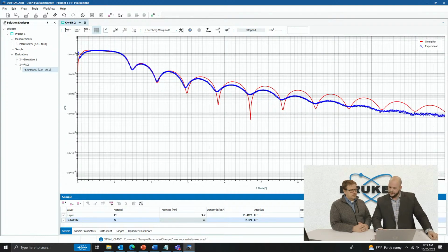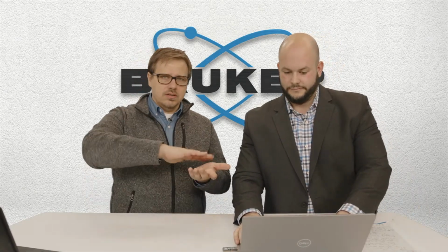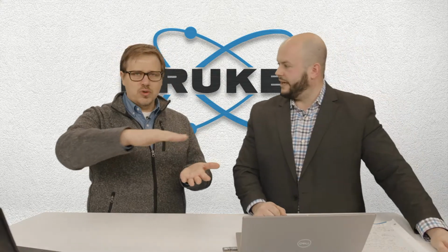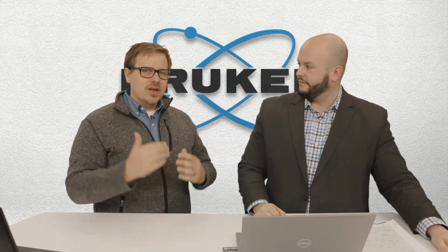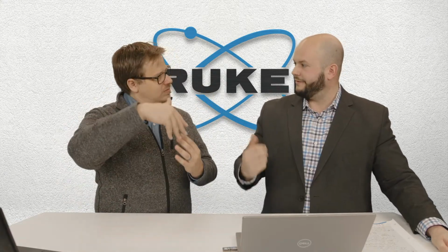how that changes, right? And one thing to note too, when we talk about roughness, is that there can be physical roughness. So that is the surface itself has, or the interfaces have a physical roughness. But here it's more about density roughness. So if you have interdiffusion. Right, like a gradient, a density gradient. Yeah, that can also be seen as roughness.